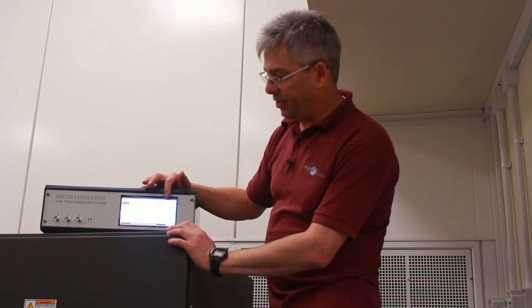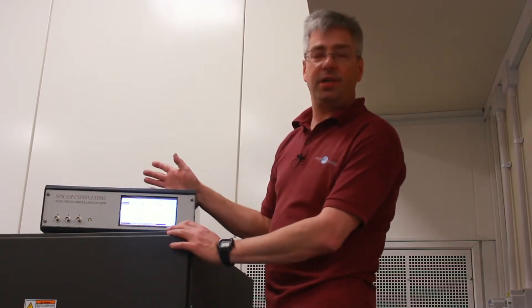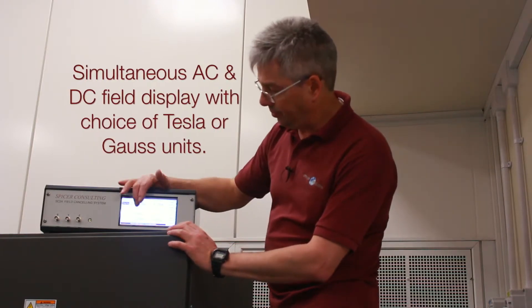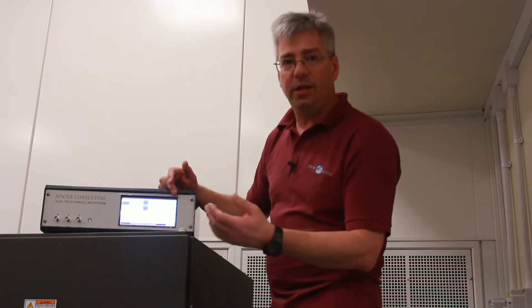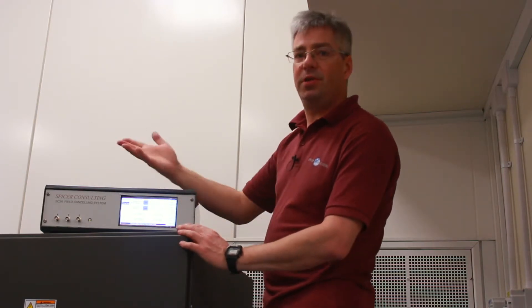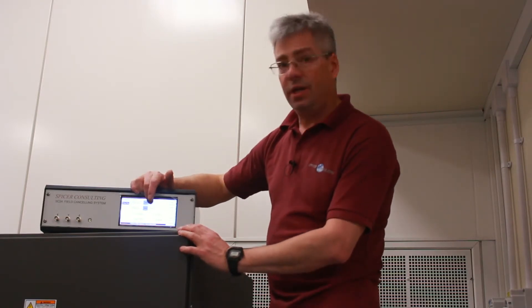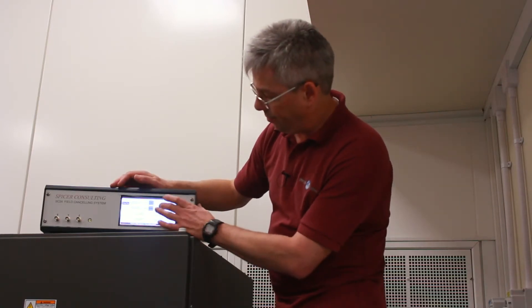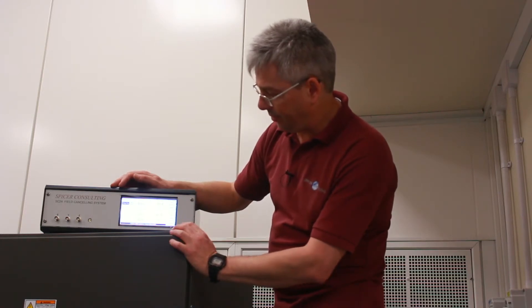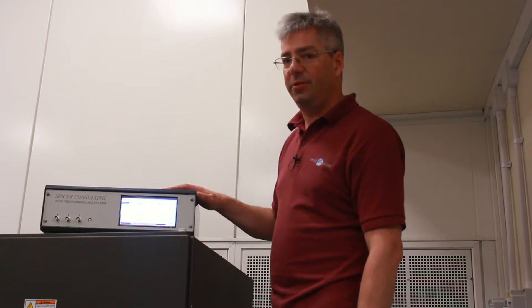So it's measuring field, but because it's only just been started, it will need setup. I'm just going to change the units to the usual ones that this microscope uses — nano tesla and peak to peak. We are measuring the field, although we are not actually cancelling at the moment.